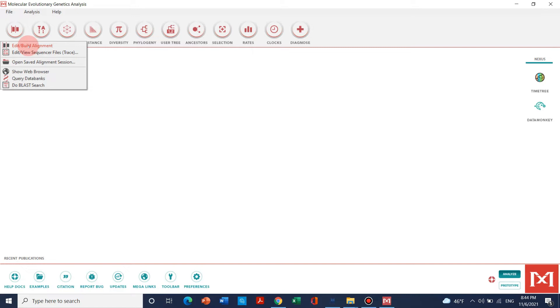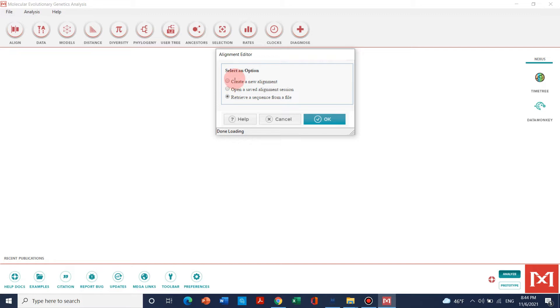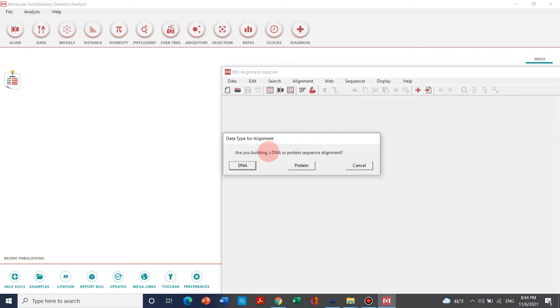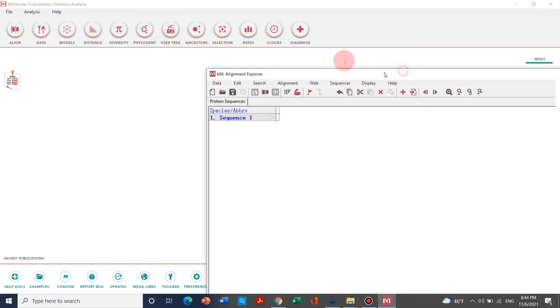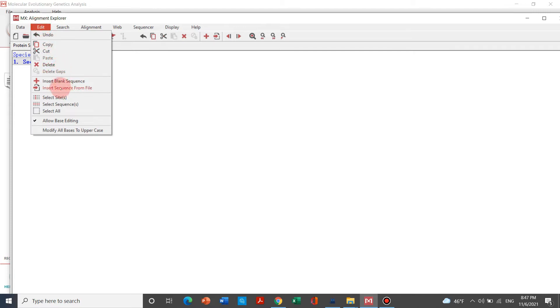We will go to Edit or Build Alignment. From here we can select the option 'Create a New Alignment' and just click OK. It will ask what you are doing — either for DNA or protein — because now we are dealing with protein. So we will click on Protein. Here is the display, and we can see that it will now ask us to insert sequences.